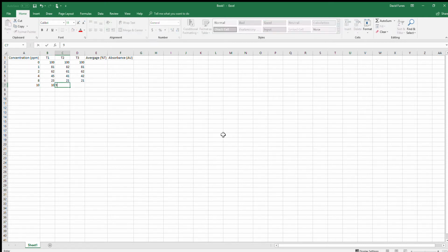Alright, so once you've added all your data, you want to go ahead and do your calculation.